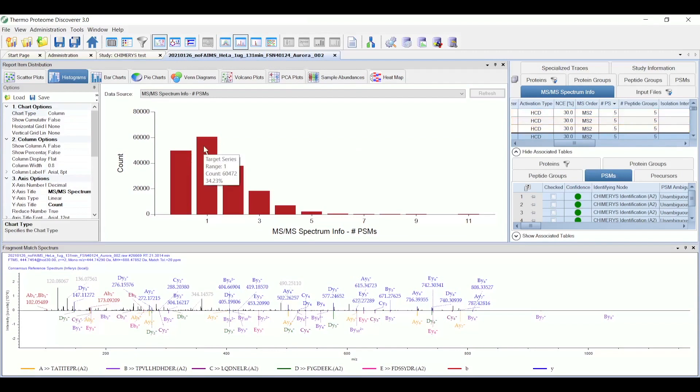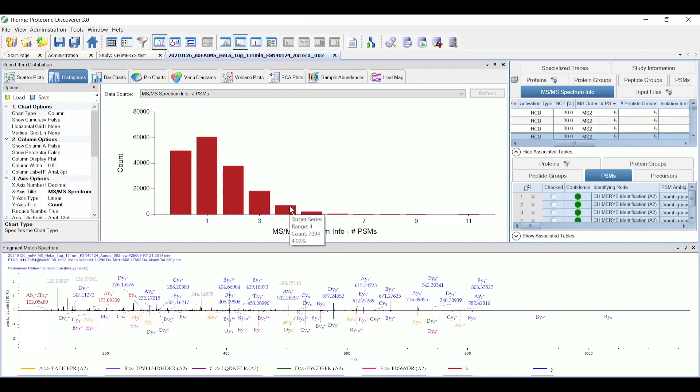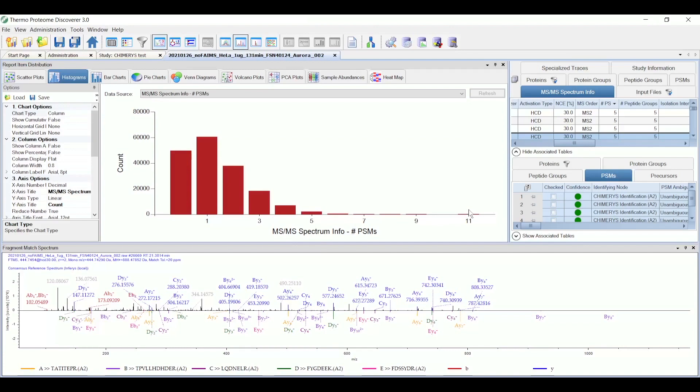So there are about 60,000 spectra with one PSM, close to 40,000 with two. There's about almost 20,000 with three, 7,000 with four PSMs, and so forth. 2,000 with five or more, and even one up to 11. So this shows the power of Chimeris to be able to handle these more complex mixed spectra to increase the number of identifications that you get in any given dataset.